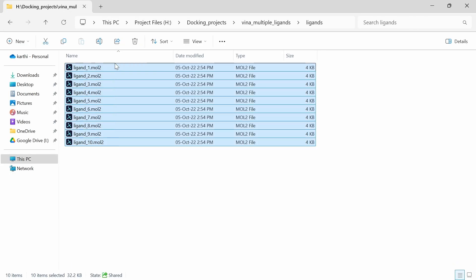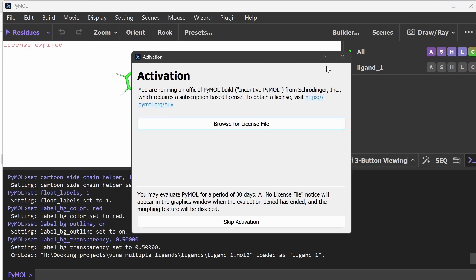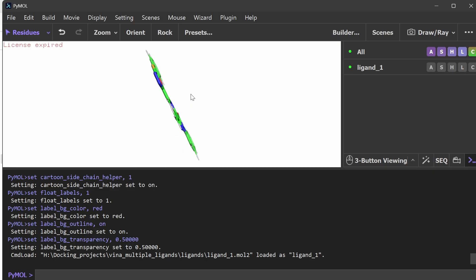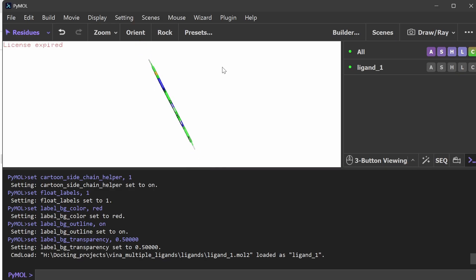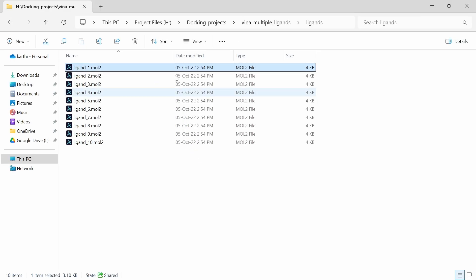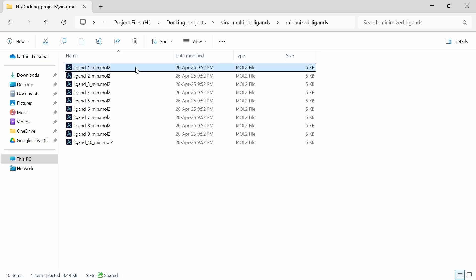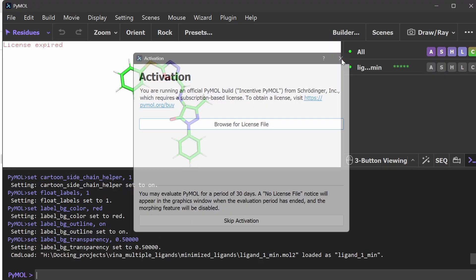Step 2 is how to minimize the ligands. In this folder I have 10 ligands. I am going to open this ligand — you can see this ligand is not energy minimized, but the hydrogens are already added. I have already done the energy minimization; this is the energy minimized ligand.